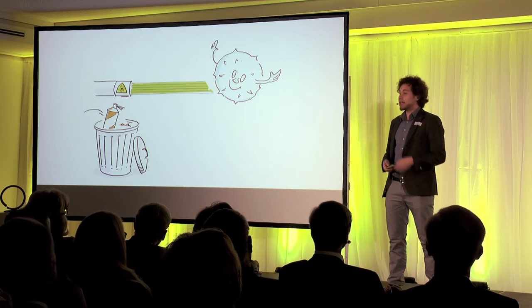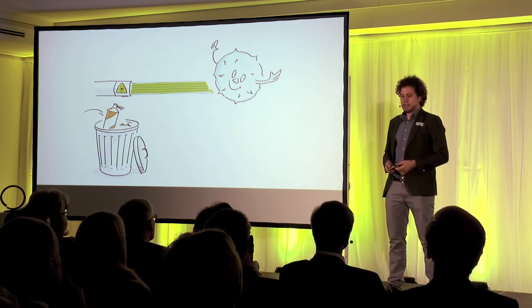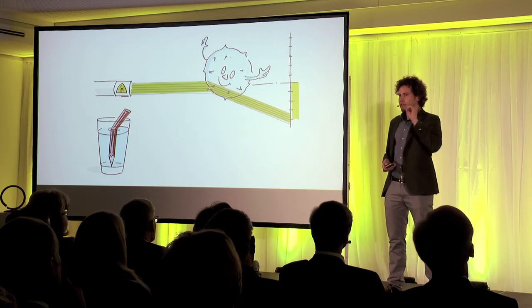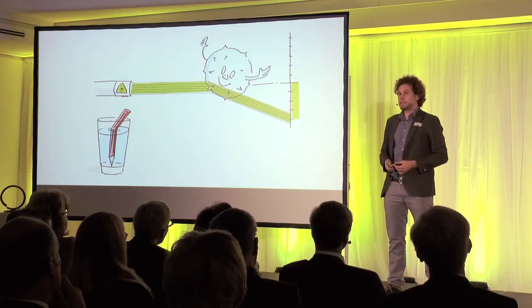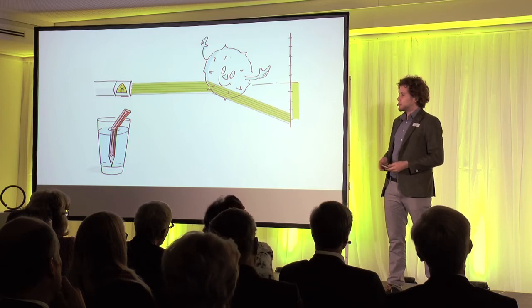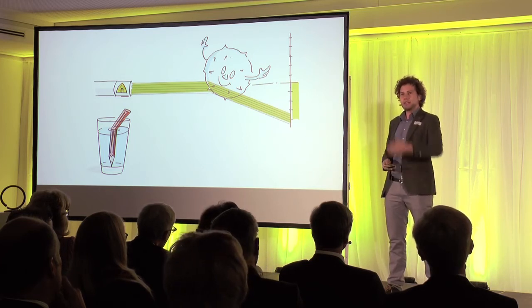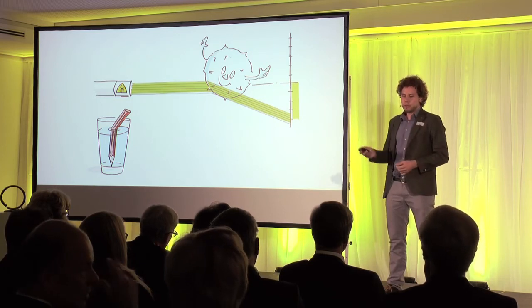Instead, what we use is another physical property of cells, which is called refractive index. So for instance, if you were to shine a laser light on the cell, the refractive index, this optical property within the cell, is different from its environment, and therefore it will deflect the laser beam. And this is something you all know from daily life. For instance, if you put a pencil, as you can see here, into a glass of water, the pencil will appear bent.